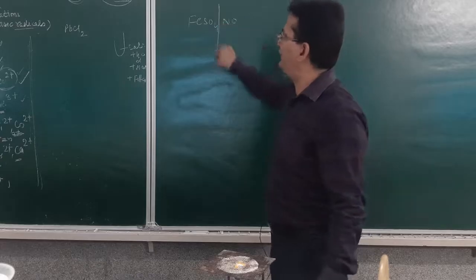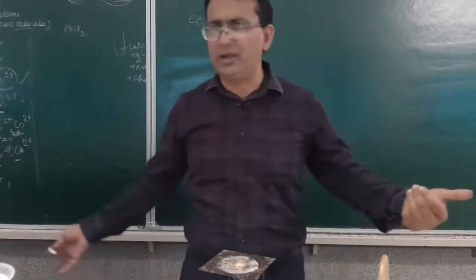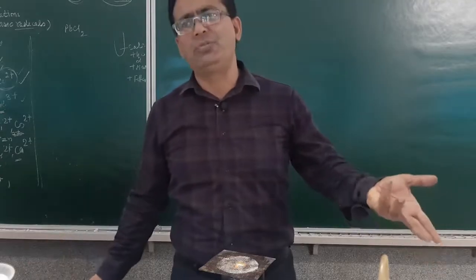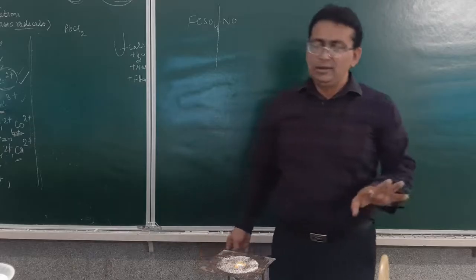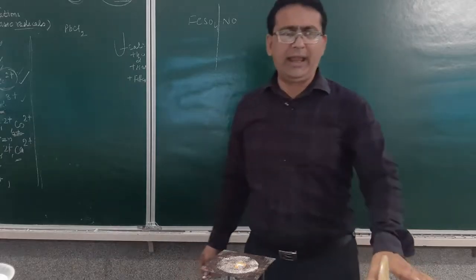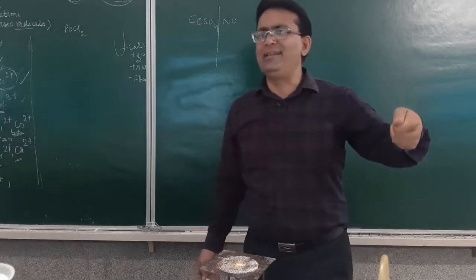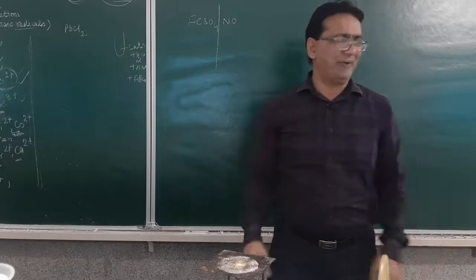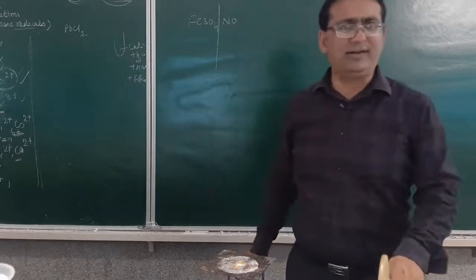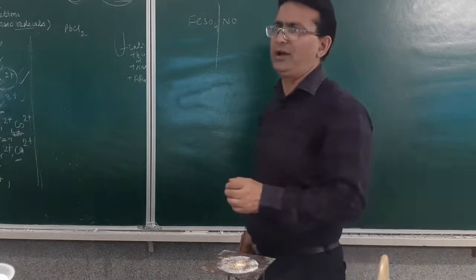On shaking, the heat is liberated, and the liberated heat will break this bond. When the bond breaks, the nitrosoferrous sulfate is not formed, and you will not be able to observe the reddish brown ring. That is why I am saying that your hand must be stable. Do not shake. Students are generally in the habit: nothing is happening, so they start shaking the test tube. Fine? So that finishes the work we have done for the identification of a nitrate ion.